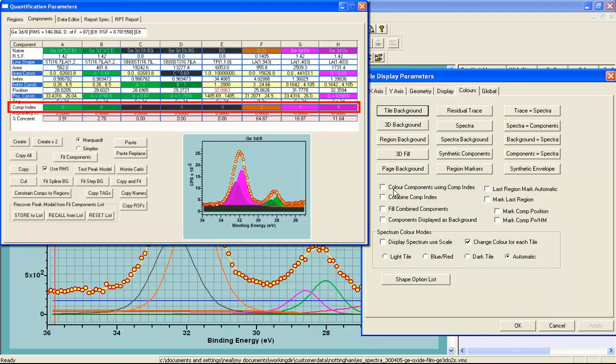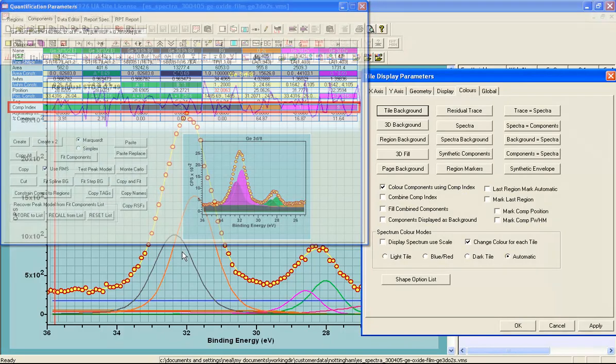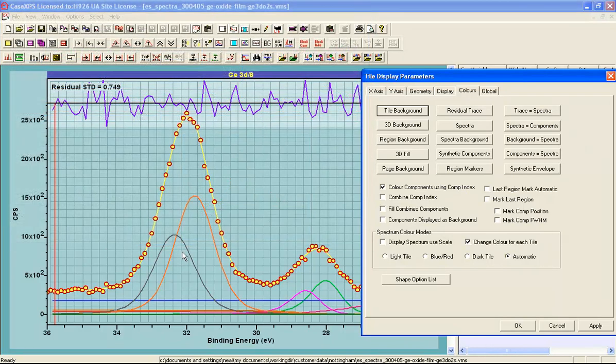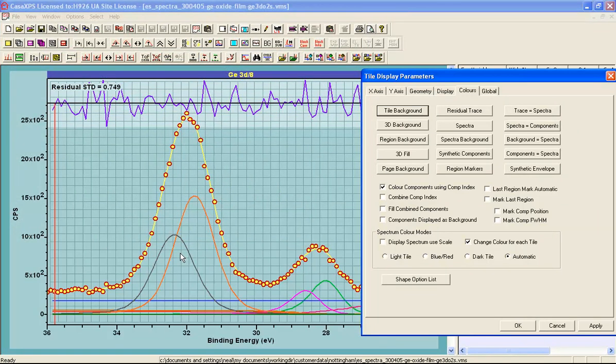When I say color components using the component index, then rather than simply using colors that are ordered by the sequence of the components on the components property page, the colors are then plotted according to the values assigned to these component indices. So when I press apply, you can see that the components now have a new color.